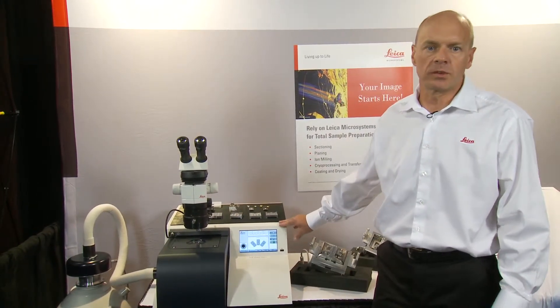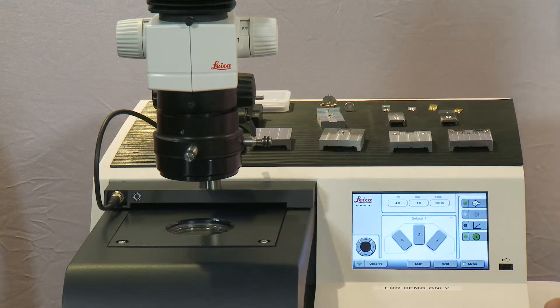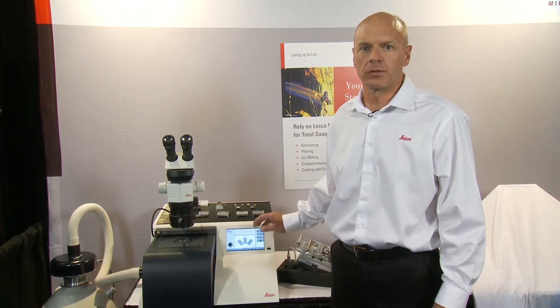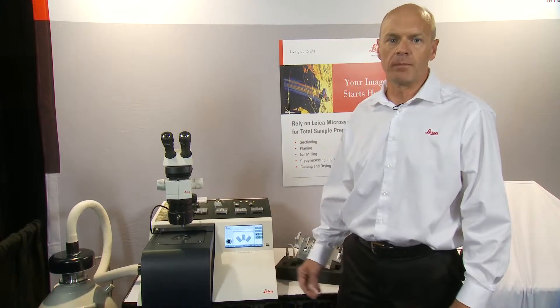This is a computer-controlled system with a very easy touchscreen interface that allows you to create very rapid milling programs and put them together for precision processes, even over a lengthy period of time.